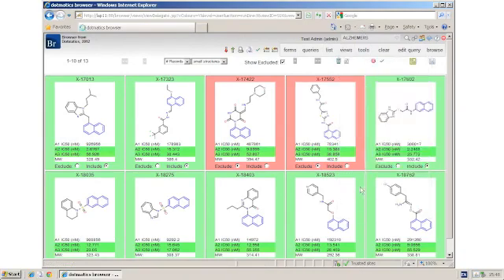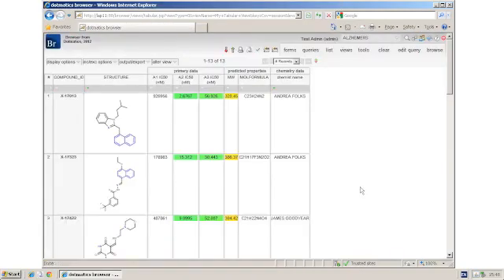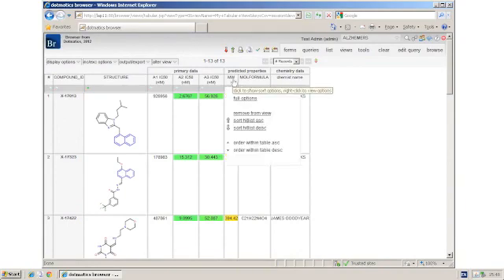We also have a tabular view where I can click to sort on properties.